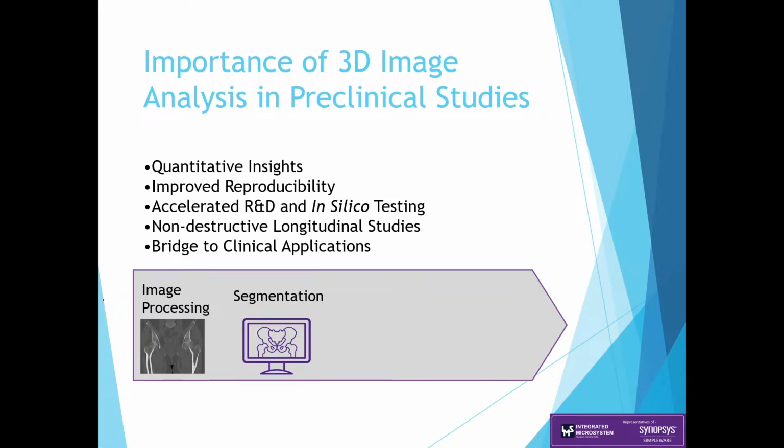The segmentation in Simpleware is majorly of three types: manual segmentation, semi-automated segmentation, and fully automated segmentation. Considering fully automated segmentation, it might not always be advisable, but it can still be used to get a common landmark of where the particular area is lying. If we are beginners with the software and don't have great knowledge of anatomy, we can definitely use the automated segmentation to get a general overview of where the exact point is lying.